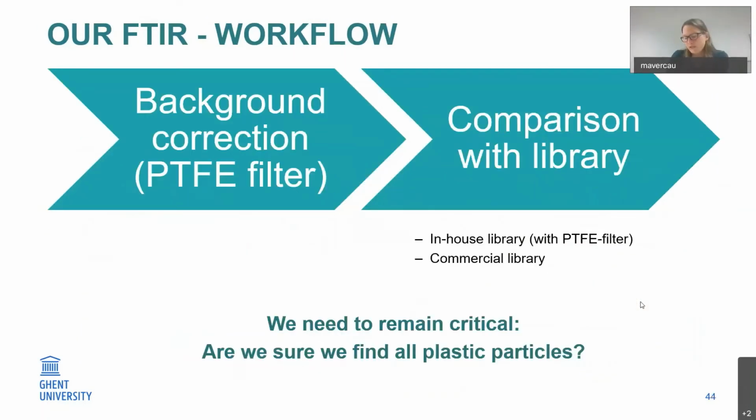We do a background correction for the PTFE filter, because PTFE is also plastic and it gives some background. So on every filter, we do a background correction, and then we compare the results. So the measurements subtracted by background, and then we compare these results with the library. And we have both an in-house library that we have put together ourselves using these PTFE filters, and we also use commercial libraries. We use them both, they complement each other.